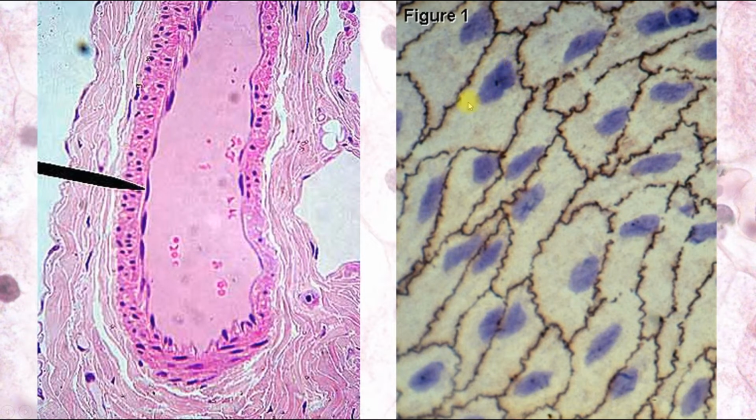Here we can see endothelium, endothelial cells, simple squamous cells, boundaries between the cells, and they are squamous in shape. And it's blood vessel on the cross section, and here we can see endothelial lining of blood vessel and endothelial cells. They are nuclei, and cells they have squamous shape, and this squamous shape and thin thickness of cytoplasm provides exchange between blood and underlying tissues.